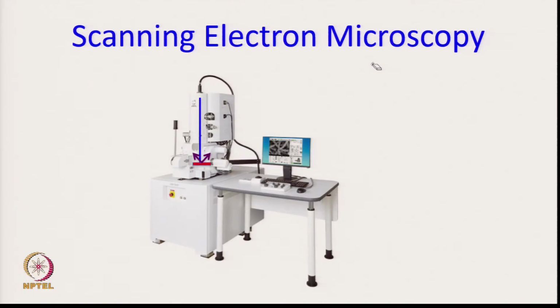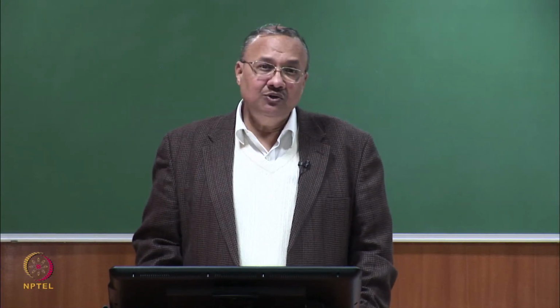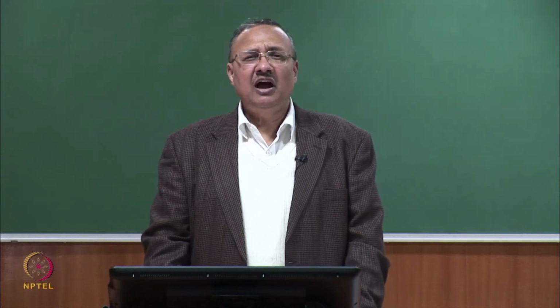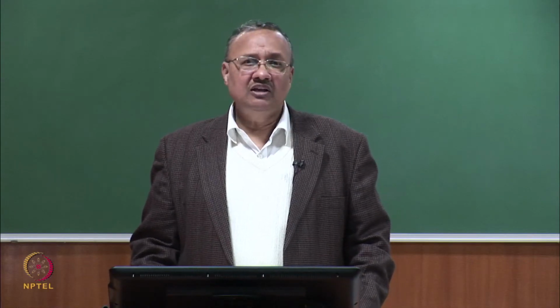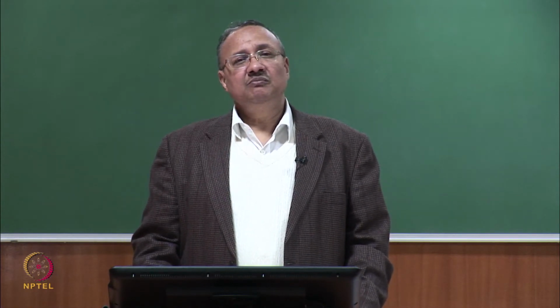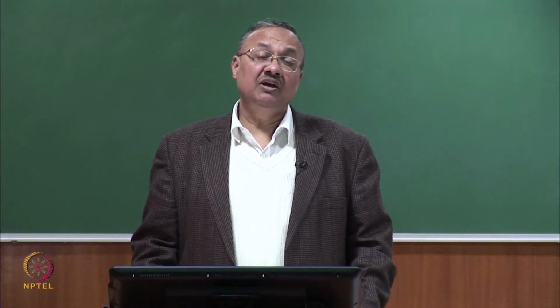And this is one technique which is very well known to everyone. It is very widely used by students and researchers everywhere, because these are like eyes to what is happening on the surface of the material. But I will give you some very simple aspects of it, how it can be useful to us, and if need be, we can actually look at how we can use it also for chemical analysis.